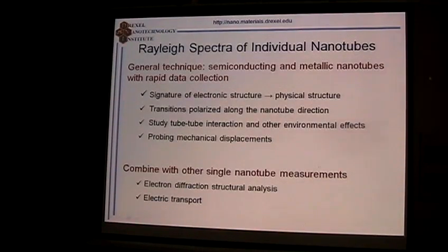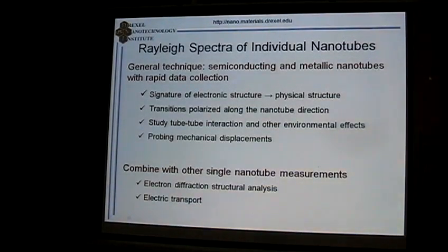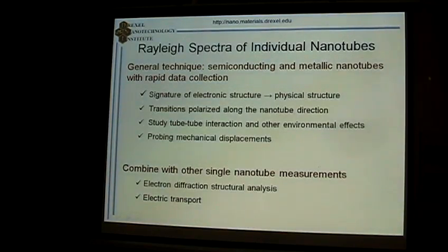So people use both methods for placing tubes between two electrodes and suspending the tubes. This can be done either on elevated contacts, or the area underneath can be dissolved, etched, removed afterwards. And tubes can also be fixed by, for example, depositing metal on the surface using focused ion beam.